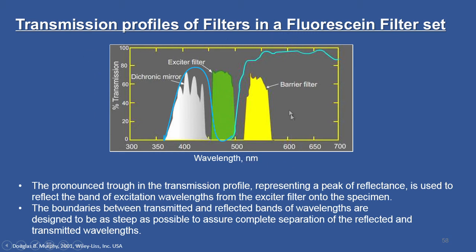Look at this schematic plot where percentage transmission versus wavelength is plotted for the three high performance filters.